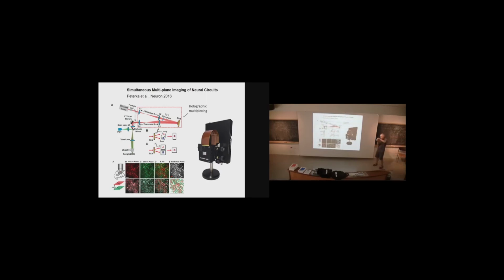A more efficient use of laser power is not using these very long extended point spread functions, but using point spread functions that are simultaneously focused at multiple planes, right? Instead of spread over multiple planes, they can be simultaneously focused over multiple planes, and you can program that into your microscope using wavefront shaping, using spatial light modulators and whatnot.